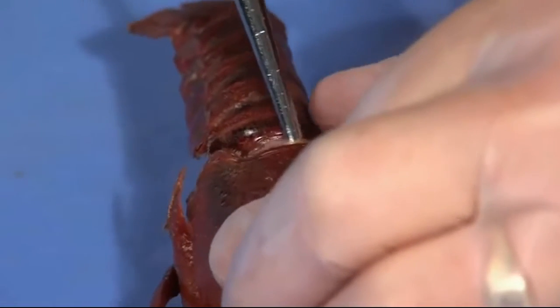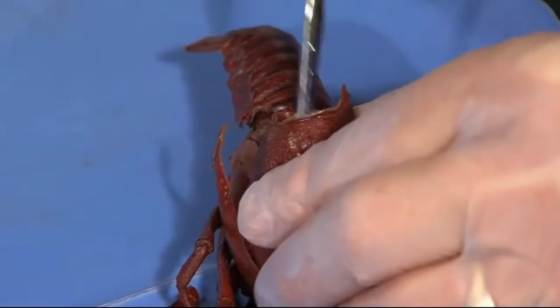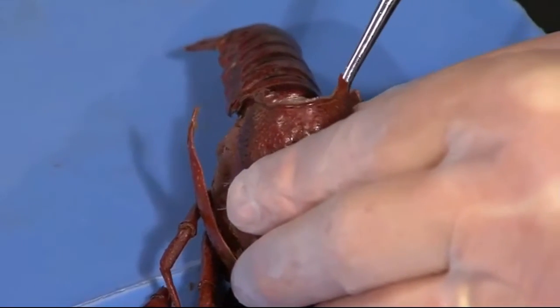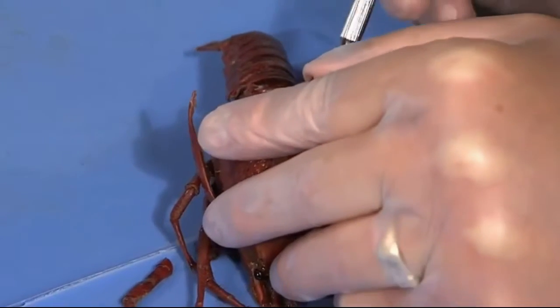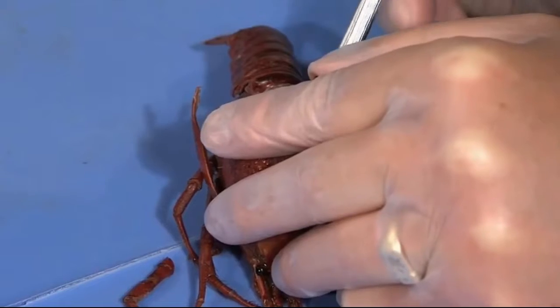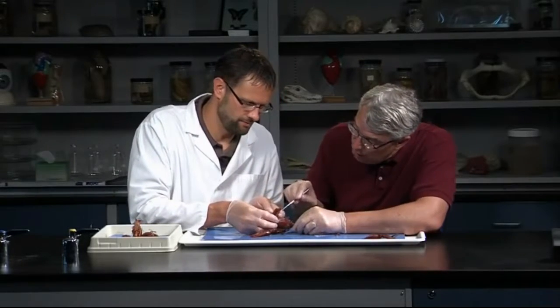Now once that carapace is loosened, we want to lift it up. As we lift it up, we want to try to keep material down in there. Particularly there's a heart, so we'll try to lift that up carefully. Some might get the heart, some might not. Yeah, I think you kind of lose heart. You can see I was opening up here.